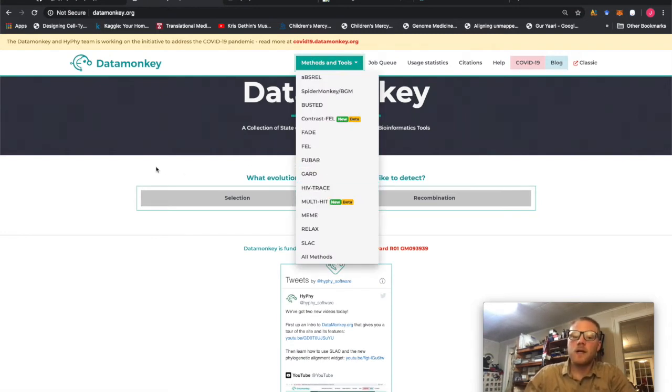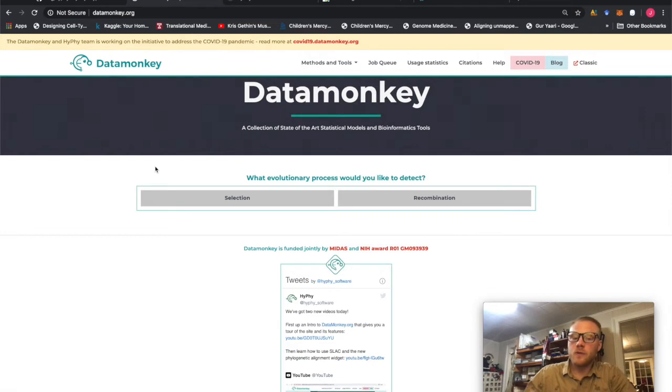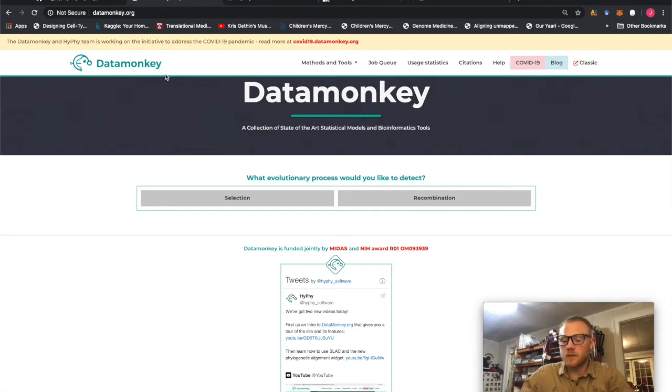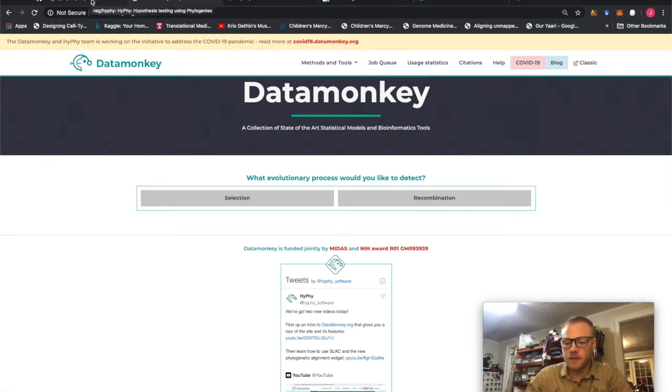However, as a user, you are limited to 500 sequences that you can upload at once. So there's a very nice alternative where you can actually download the HyPhy package itself and run it locally. So today, that's what we're going to go through.